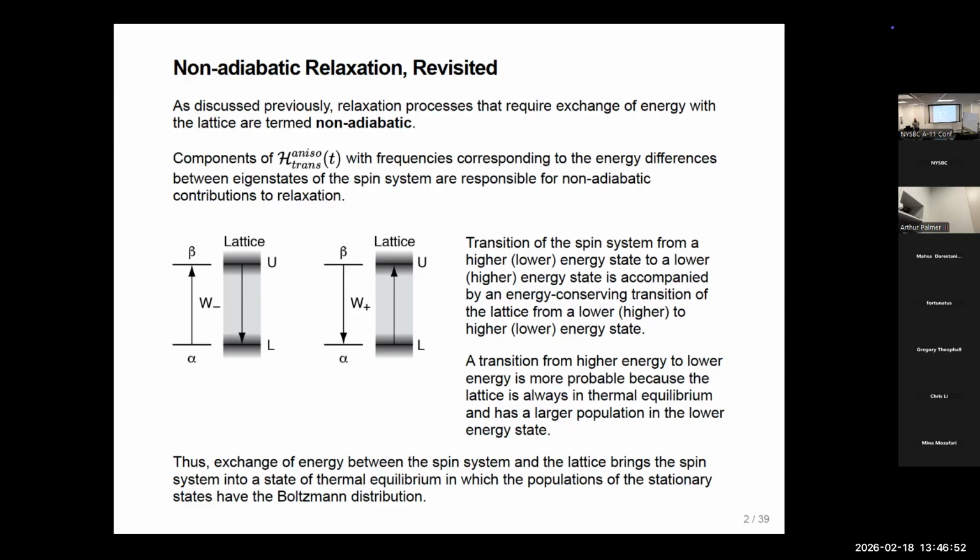So you're measuring infinitesimal changes in energy in our 1 millimolar of protein, say, that's getting dispersed into all these other degrees of freedom. So, while yes, we're depositing energy or taking it out, the lattice is just huge compared to the nuclear spins. And the amount of energy in NMR is so small. I suspect it's probably been decades since anyone thought it was useful to measure the temperature change.